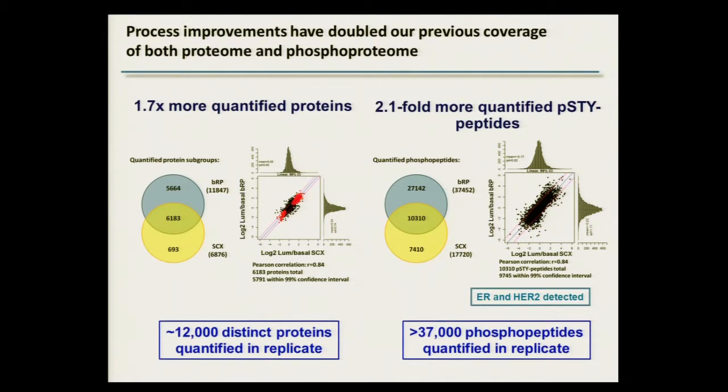And if for both versions the quantitative results cancel out, then it's an indicator that this is an artifact that was caused by sample handling and not a true biological effect. So it's always important to understand what's happening with your sample to be able to sort out artifacts that are derived from sample handling. But that's a good question, of course.